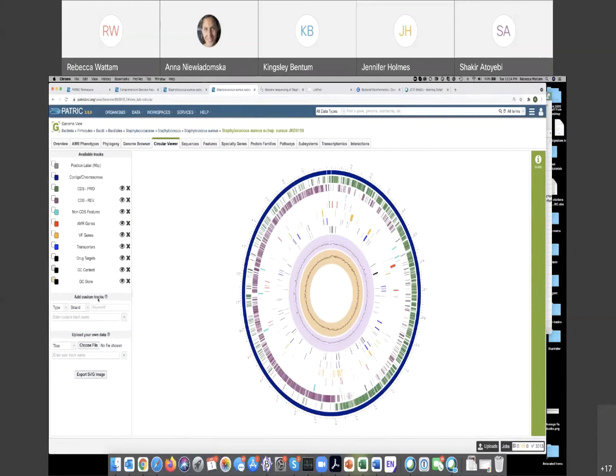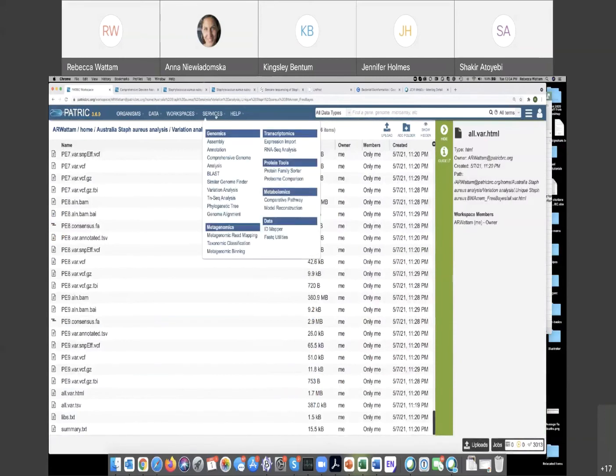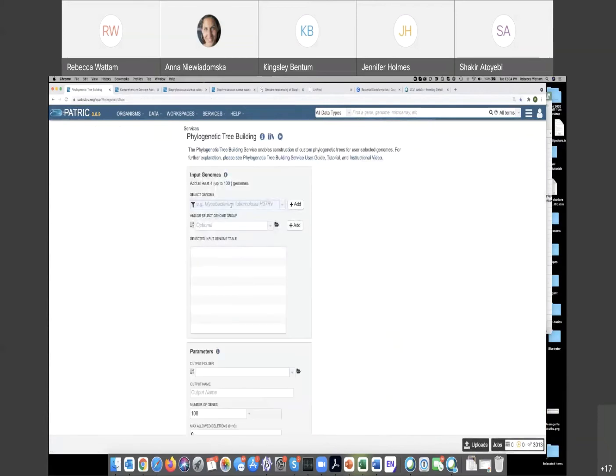That's so cool. Okay, so Steiner et al., they did the alignment, they did the assembly, they did a SNP service, they also did a tree. So let's go. They say that only God can make a tree. Well, all of us can make a phylogenetic tree in PATRIC. So we go over to the phylogenetic tree service. Now, I'm not going to show you how to create a genome group right now. I'll do that in a few minutes.